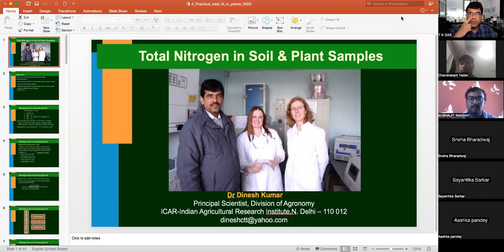And why do we estimate total nitrogen in plant samples? So in plant samples, anybody can tell me what is the purpose of estimating nitrogen in plant samples? Why do we estimate nitrogen in plant samples? Anybody can come. Sneha, why do we estimate total nitrogen in plants? Yes. So that we can estimate the uptake of nitrogen by the plants, the accumulation of nitrogen in the plant.